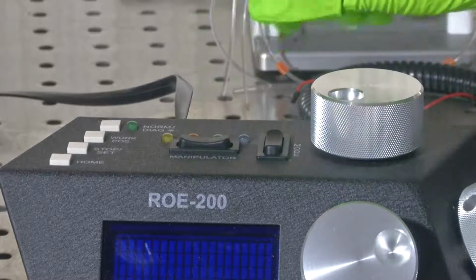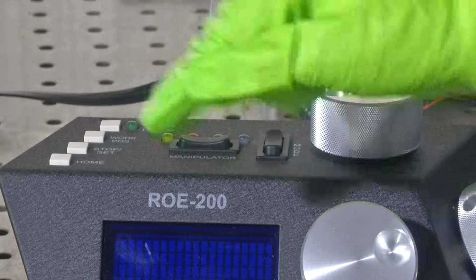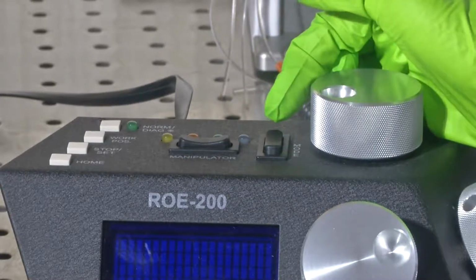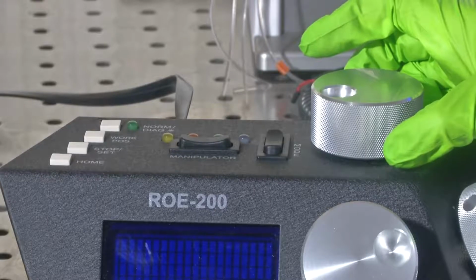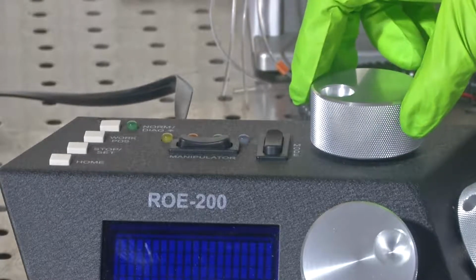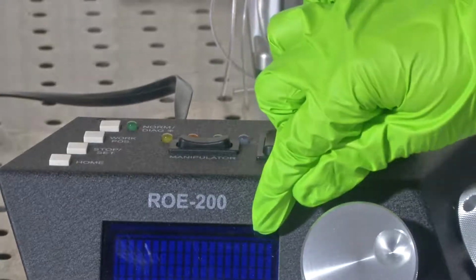So, this knob allows us to choose the manipulator which you are operating, and then there is mode, which controls how quickly the knob responds. It is about the relation between the amount of rotation you give to the knob and the amount of displacement.